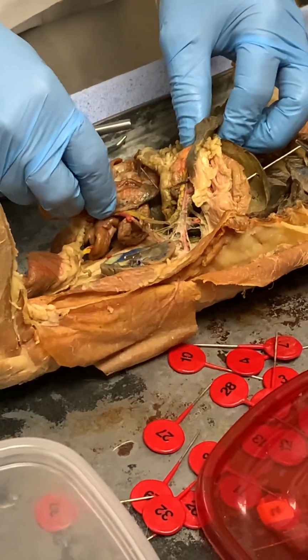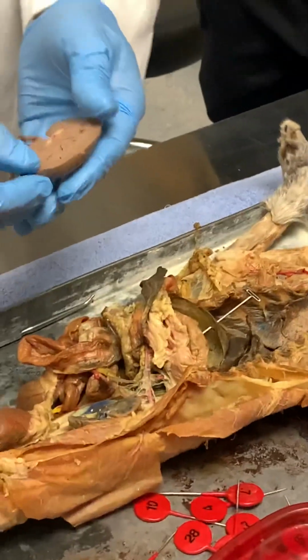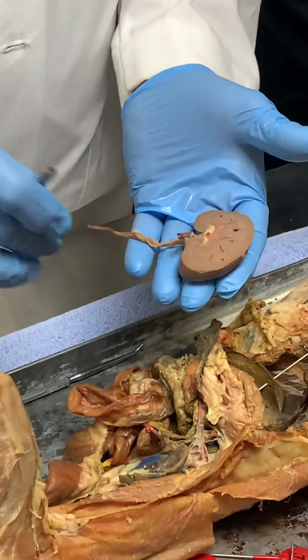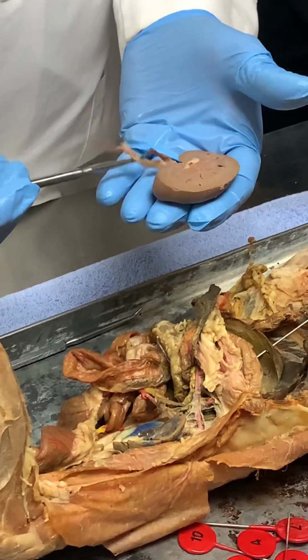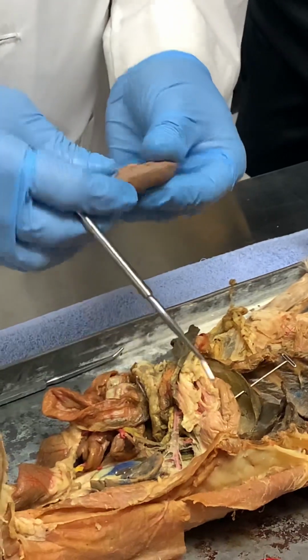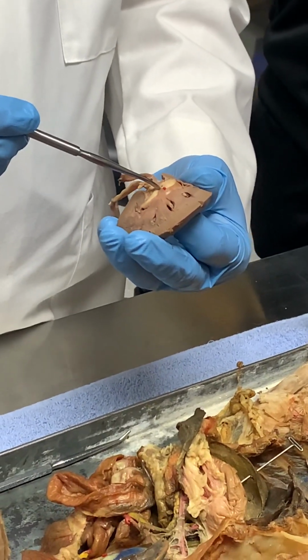the urinary system. Now, I could show you, this is the sheep, remember, and this is the cat. A couple of things you can see better on the sheep. This would be the ureter, this is the hilum. These right here are the calyxes that come down into the pelvis.